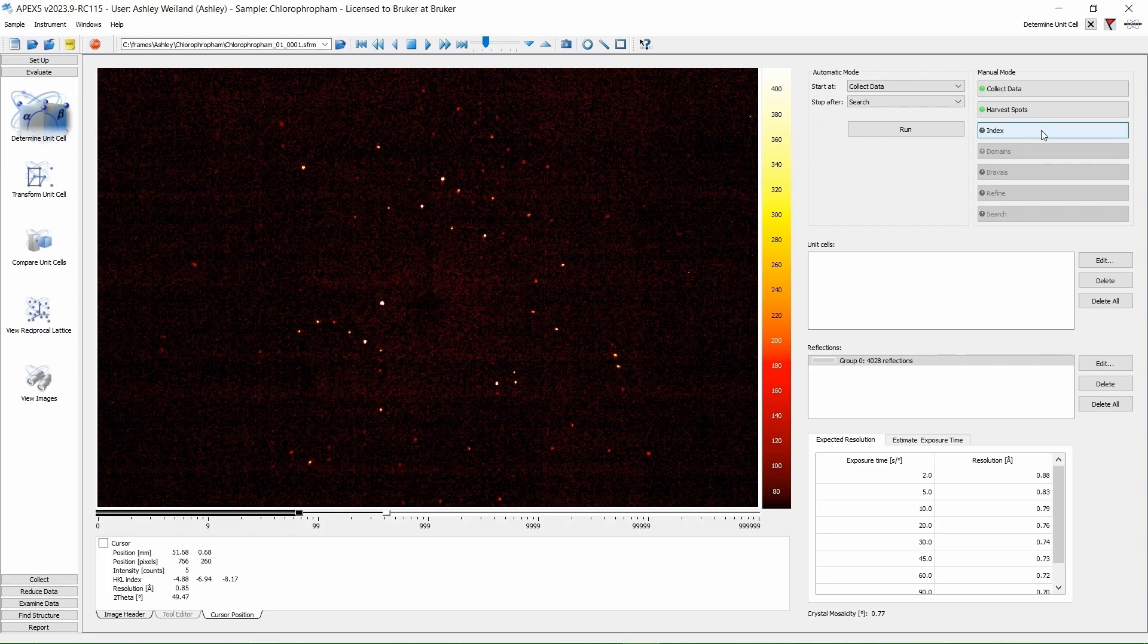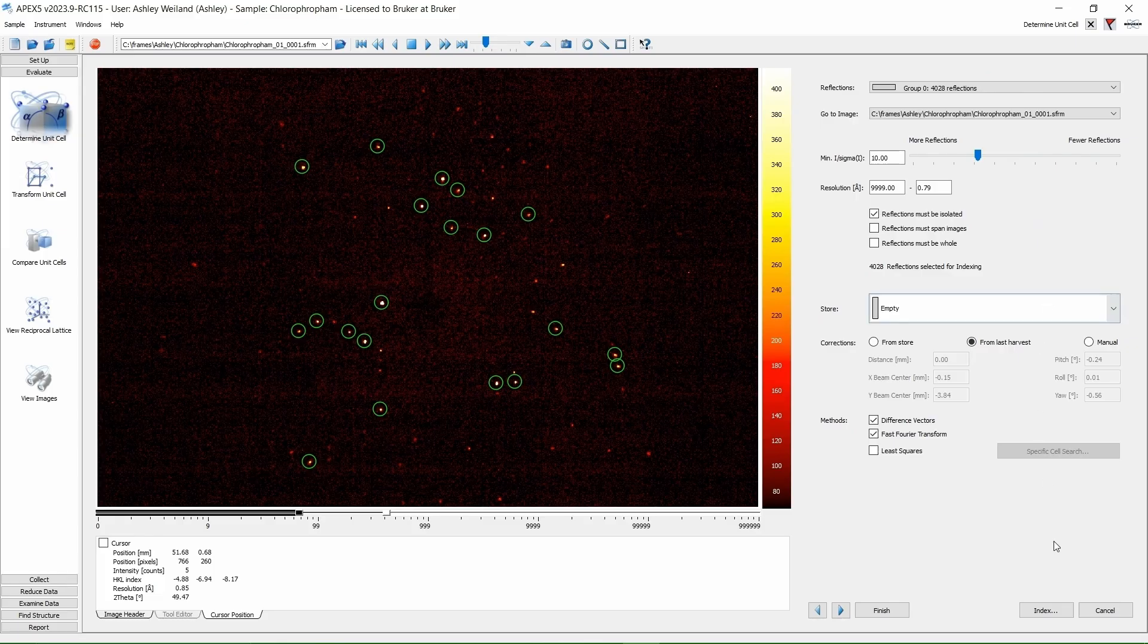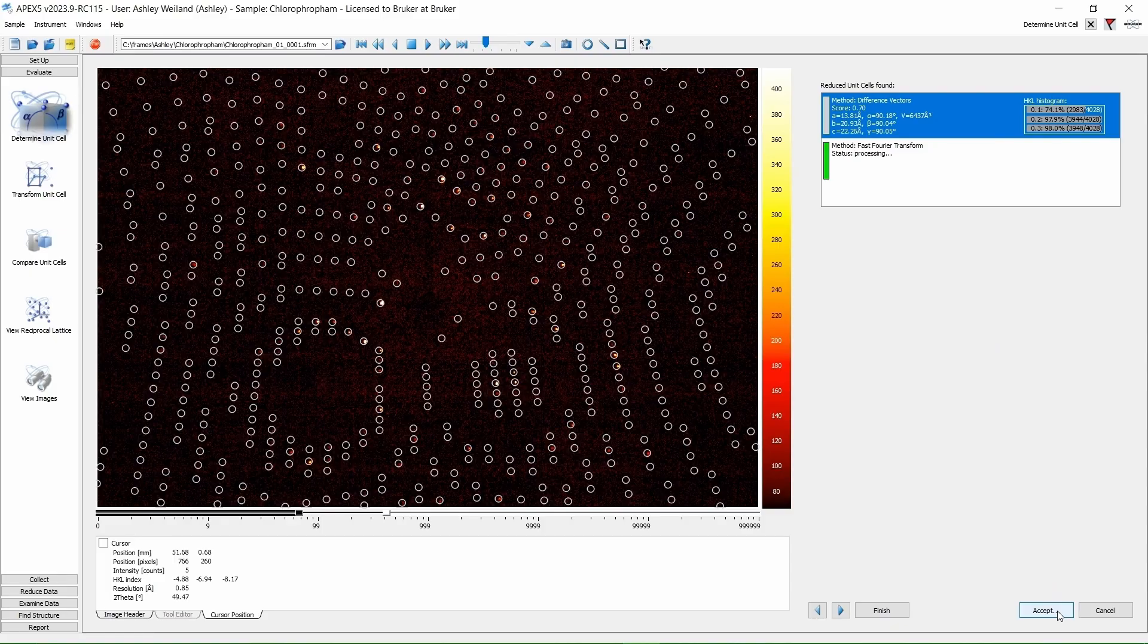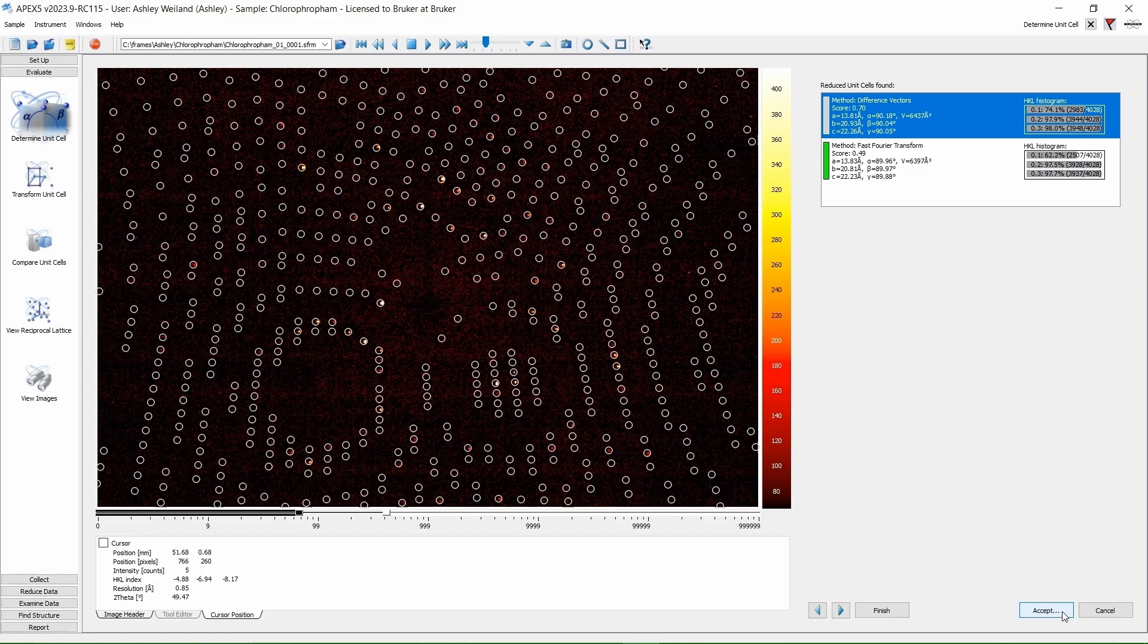Next, click Index. And at the bottom of the screen, click Index again. This will try to find a relationship, a periodic pattern, between these reflections. Two different mathematical methods come up with similar results. This is a good sign. We are going to choose the method with the higher score value. It is automatically highlighted and selected for us. Click Accept.